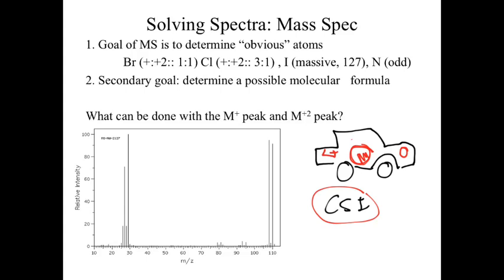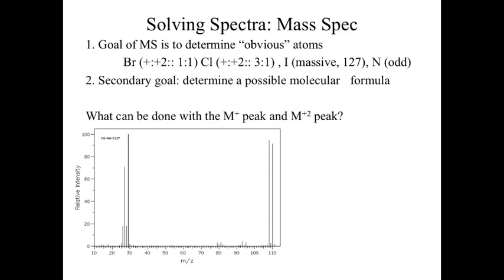Well, mass spec is very similar. Instead of using a car, we'll take an individual small organic molecule, and then we're going to blow it up. And in that blow-up process, what we're going to end up doing is removing an electron. So if we clear all of that away, we have, say, our molecule. There's a molecule. It has electrons in it, and it's got a neutral state. Well, mass spec fires some kind of energy and knocks one of those electrons out.